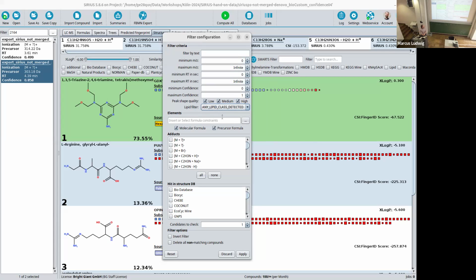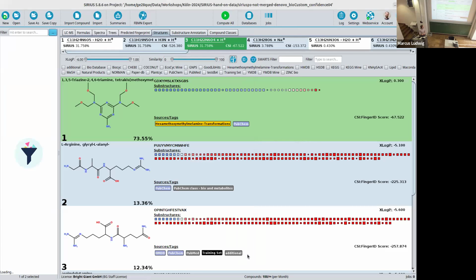But again, someone took some time to make a reasonable machine learning method to predict all of that, and not just a nice button. So we always have a specific name for each method, also to present it in a publication. But you just need to do this, and then it should go over all your hits and find the lipids in the annotations.